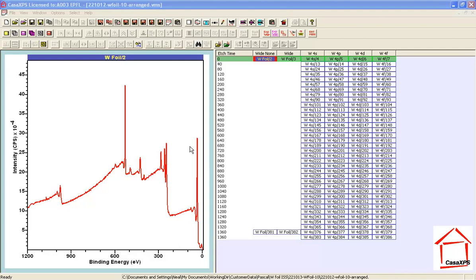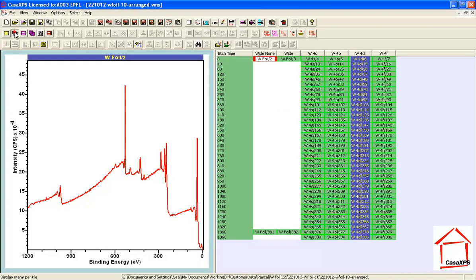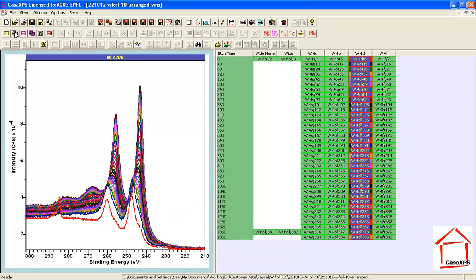In this video I'm going to illustrate how data can be analyzed to work out what types of shapes are present within a set of spectra that have some relationship between each other. In this case it's a sputter depth profile, and the relationship is that we start off with a native oxide layer, and we can see carbon here.